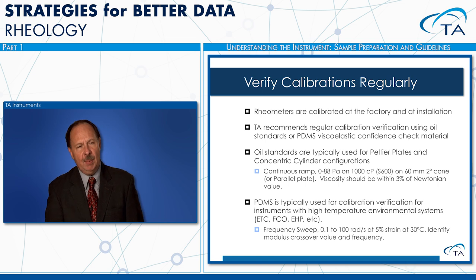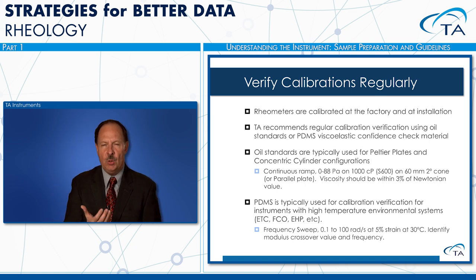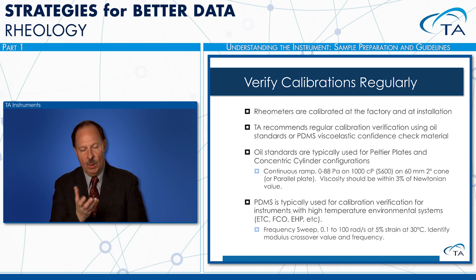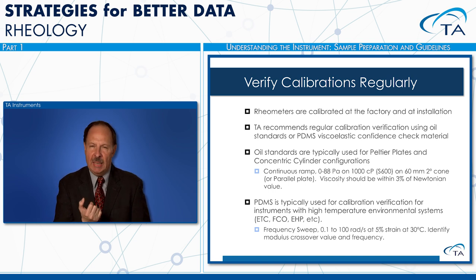And as I mentioned, if you're going to be running something with the ETC or the oven, specifically something like polymer melts, where you want to look at the viscoelasticity of polymer melts, a material that's very good to run is PDMS.